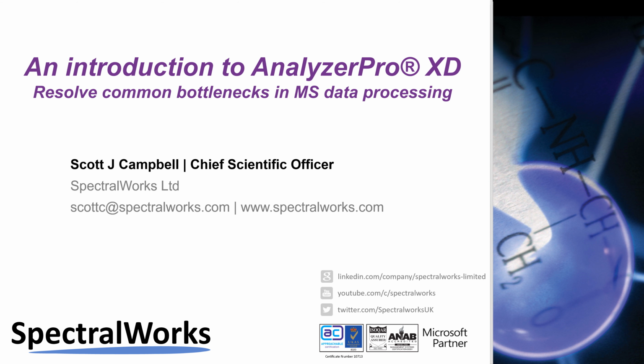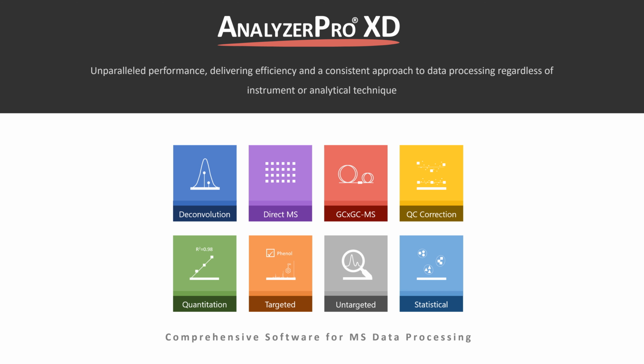In today's webinar, I want to introduce you to AnalyzerPro XD and show you how our vendor-independent software package can help reduce the bottleneck in your mass spec data processing workflow. AnalyzerPro XD is a mass spec data processing tool.